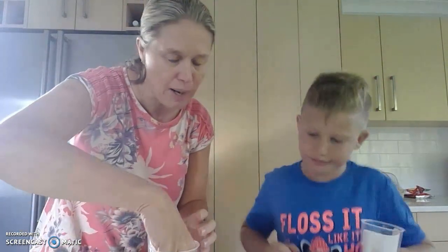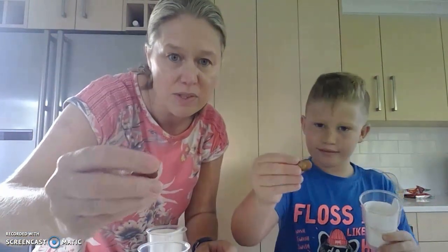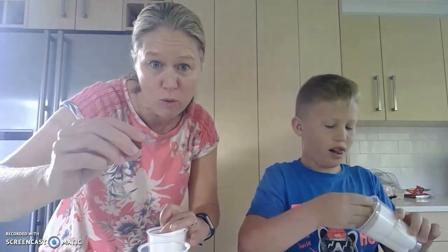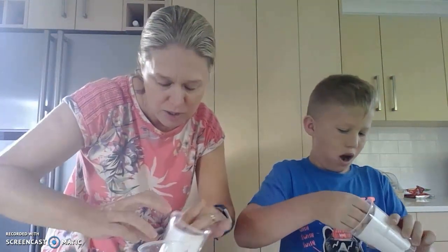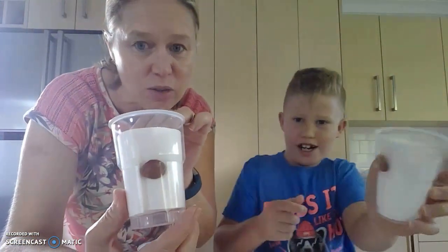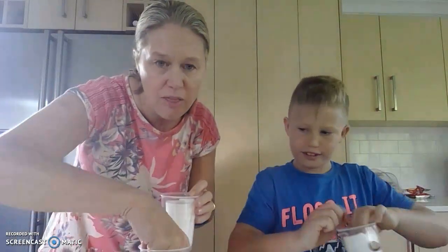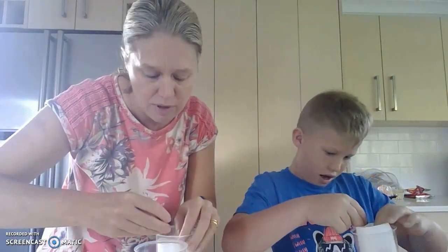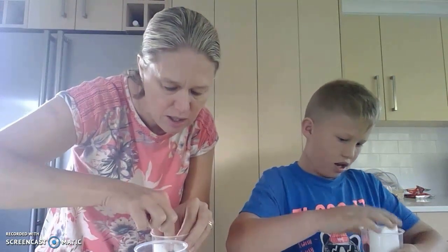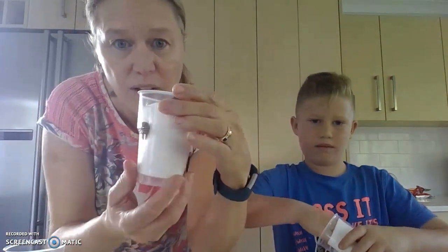Now we've soaked some broad beans just to get them going a little bit quicker, and we're going to take our broad beans. I'm going to put one of them sideways, because of course when seeds disperse they don't necessarily fall the right way up. So we're going to shove one down one side - got yours, Thomas? - and then we're going to put another one so it's standing upright the other side.